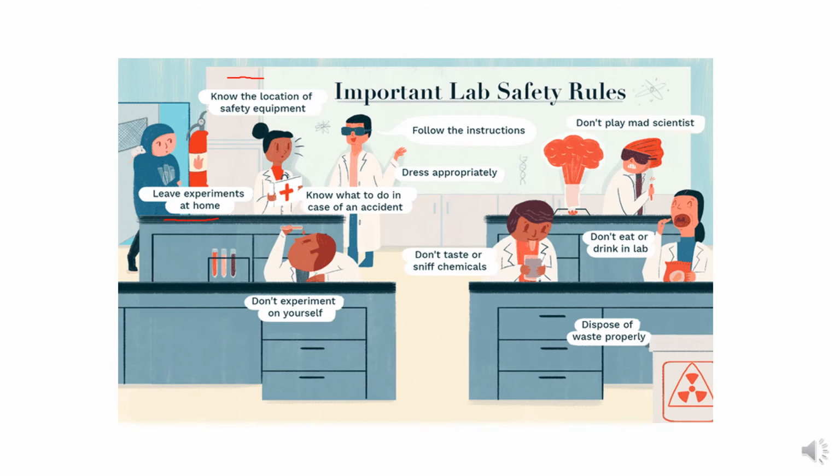And also you should have basic information. If an accident happens, what you have to do, how you can apply the first aid kit, how you can use it and where it is. Okay, all these, and of course dress up properly and follow the instructions of the labs. Mostly in each lab they mention the instructions at the main door where you enter.